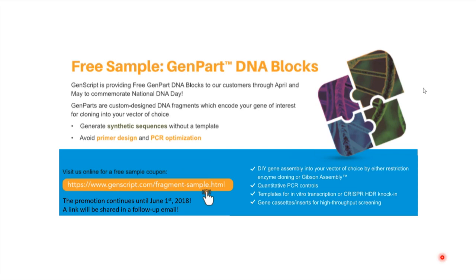So in my lab, we actually have a lot of different research directions going on. And one of them is in engineering new biocontrol agents for insect population suppression. That's very different from our metabolic engineering aspects. But yes, I would say that the throughput for engineering invertebrates is much lower, but many of the same design principles apply. Basically, if you recognize that engineering any organism is going to be difficult, what these DNA assembly approaches give you access to is the ability to take multiple shots on goal.